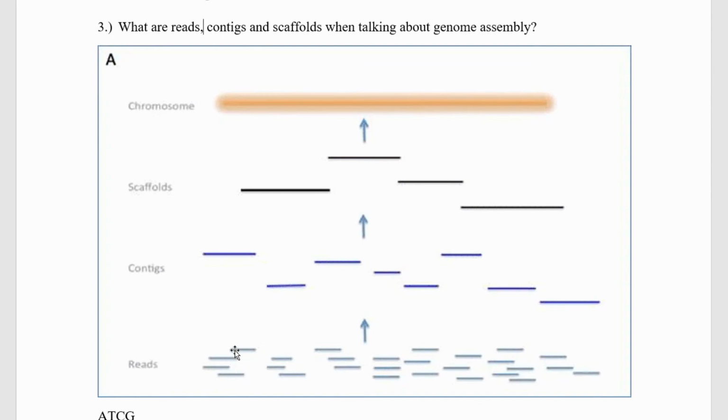So where they're overlapping, the code is the same because they're coding the same part of the chromosome. So this is unique code for this first bit, and then here in this area, these 3 reads are overlapping and it's the same code. And then here, these 3 are overlapping, and then here's some unique code at the end.